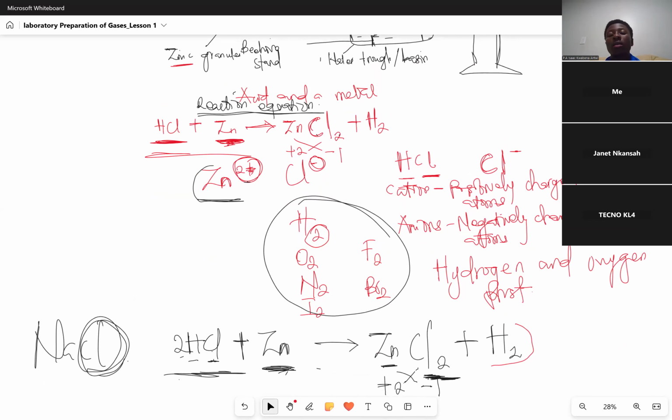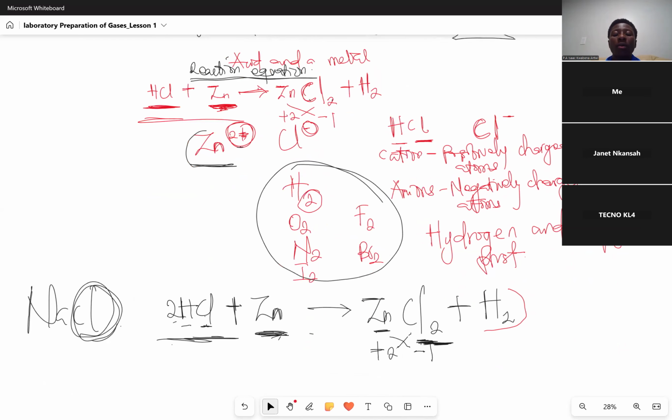Let me know when you are done. What are you noticing? When you react an acid with a metal, see at the product, what has been observed? H2 has been produced: hydrogen gas, the hydrogen molecule. So whenever you react an acid with a metal, hydrogen gas is produced.